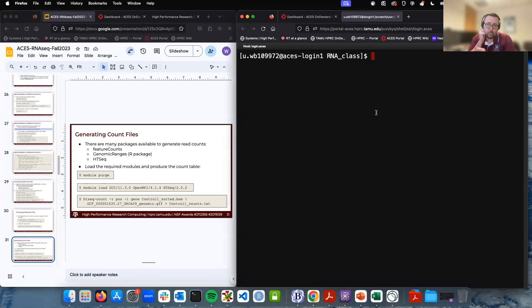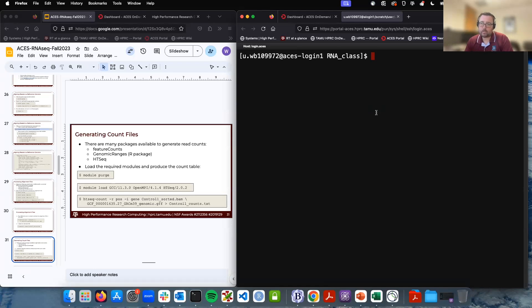There are many packages available to generate read counts. We're going to use HTSeq today, though there are also featureCounts and a package I really like called GenomicRanges, where you'd move right into R after sorting your BAM files. HTSeq works well for this short course since generating read counts in R can take quite a bit of time.